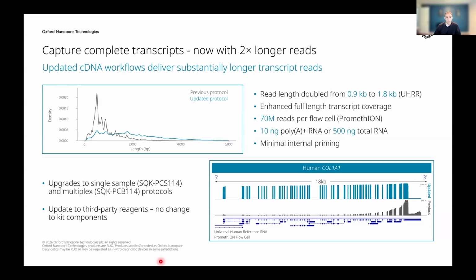One thing to note is, again, if you've already used these protocols, or used our cDNA protocol in the past, the new protocol actually does not change any of the Oxford Nanopore kit components. It changes strictly the third-party reagents. So it's really straightforward for existing users to adopt into this improved workflow. Or, if you haven't used long-read sequencing from Oxford Nanopore before for RNA, the protocol remains just about as straightforward as it was before.